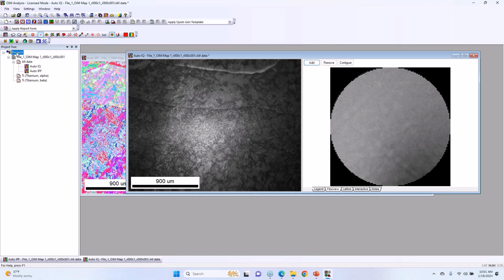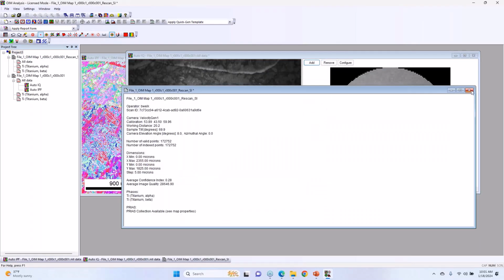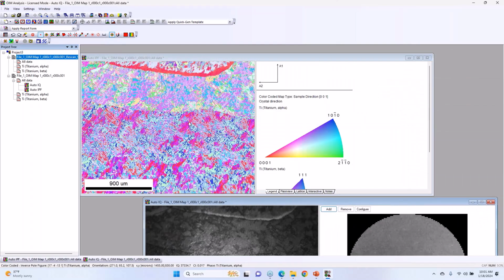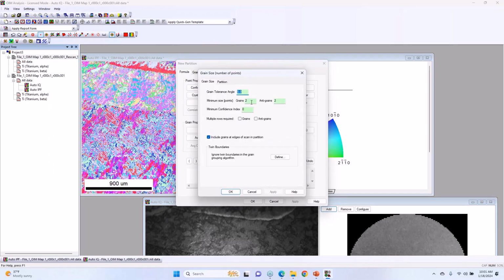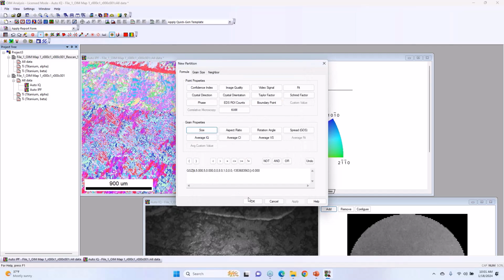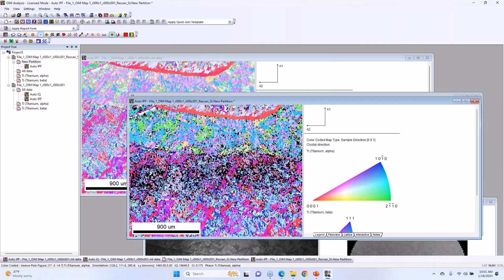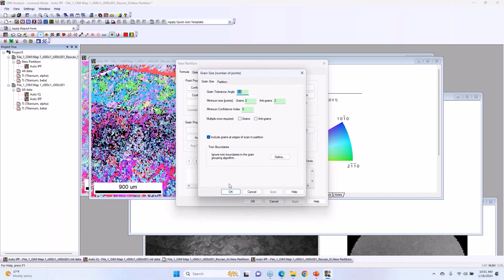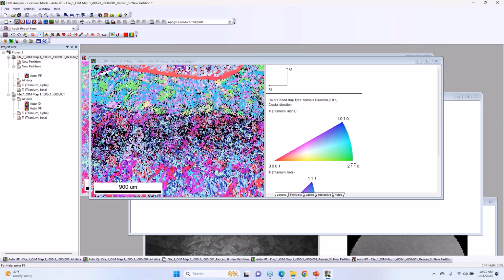So running through this, here, this is with the spherical indexing. And this is one that's a little tricky because this is looking at a large area, so the step size versus the feature size is a little different than some of the single fields. If we put in a 5-degree grain, you can see that we get about 80% indexing. But if we look at a partition and do 2 degrees, then that jumps up some in terms of performance.